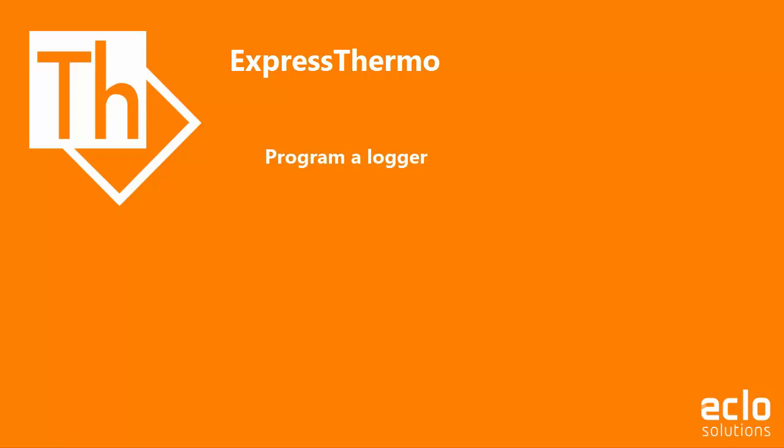In this tutorial we went through the required steps to program a logger. We revised the programming interface, the various settings available, their options, and actually programmed the logger using a real-life example.